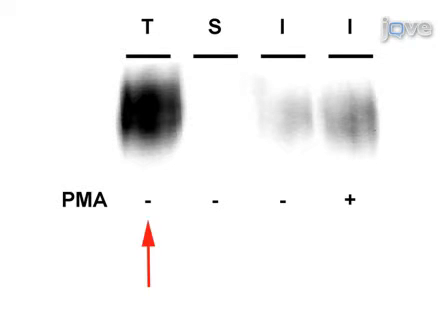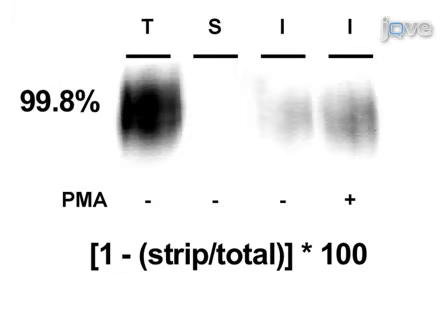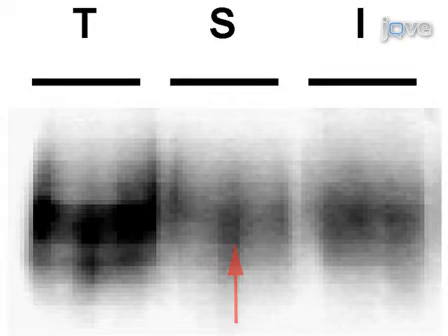A representative immunoblot from the reversible biotinylation procedure on the dopamine transporter is shown here. The strongest signal is the total amount of surface protein prior to internalization, seen in the total lane (T). The strip control (S) should ideally be close to blank and display high strip efficiency. Strip efficiency is calculated using band density measurements in the following formula. The strip in this experiment was 99.8% efficient. Strips greater than or equal to 90% efficiency are optimal, and results below this level should be discarded. An example of a poor strip shows a visible band in the strip lane with a strip efficiency of only 34%.